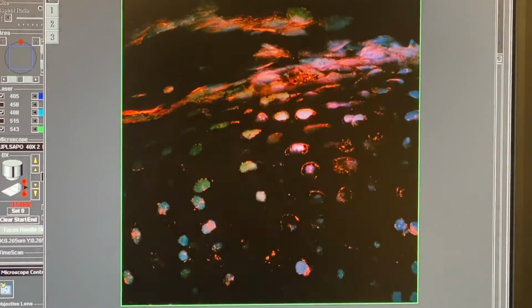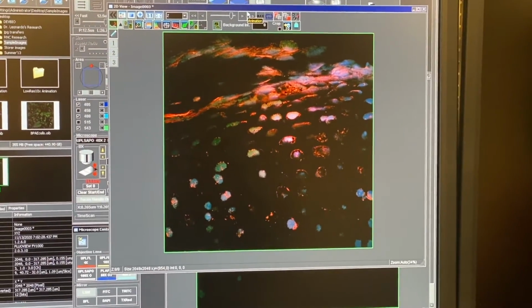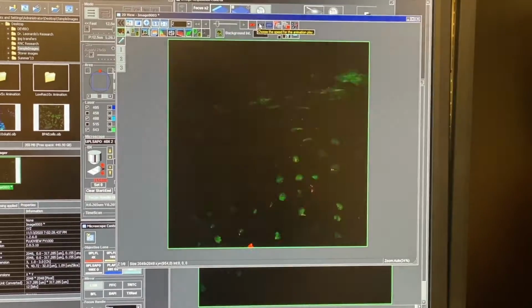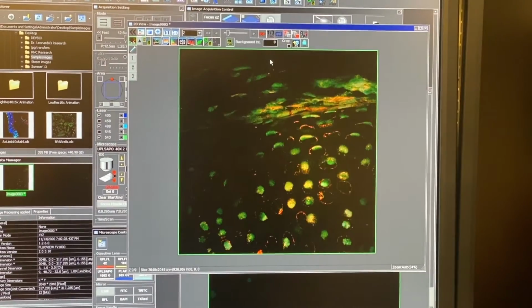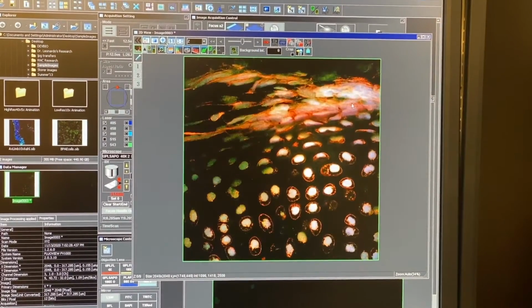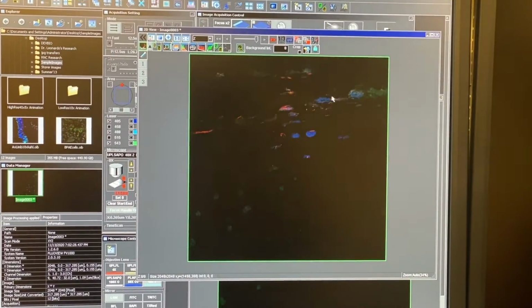Next, number 7, number 8, and now we're getting down to the bottom of the slide where the antibodies couldn't penetrate. Oh, whoops, did I hit slide through at max speed? Let's slow that down. Here's your 9 tissue sections. 1, 2, 3, 4, 5, 6, 7, 8, 9.